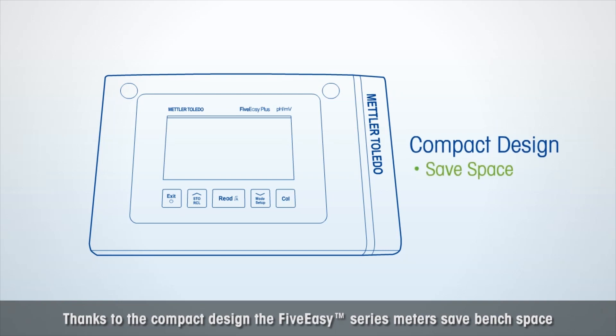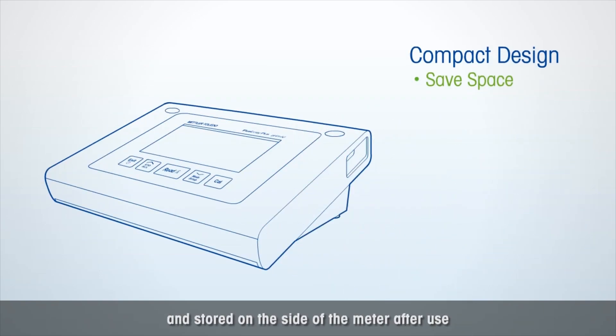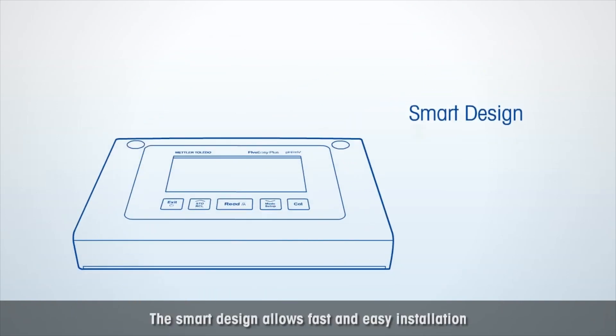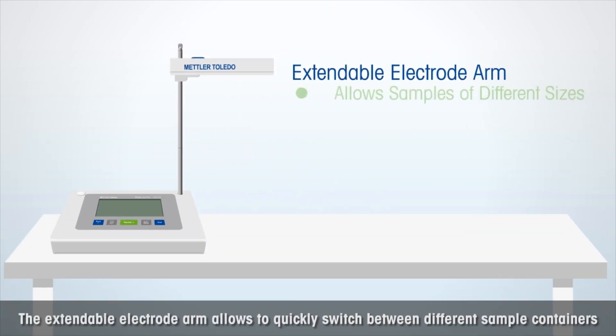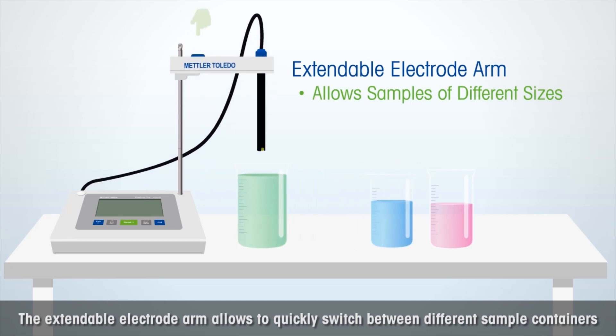Thanks to the compact design, the Five Easy Series meters save bench space. The sensor holder can be easily removed and stored on the side of the meter after use. The smart design allows fast and easy installation, and the extendable electrode arm allows you to quickly switch between different sample containers.